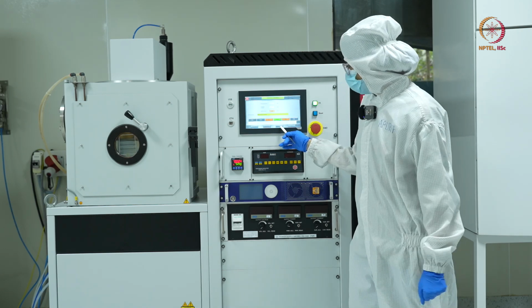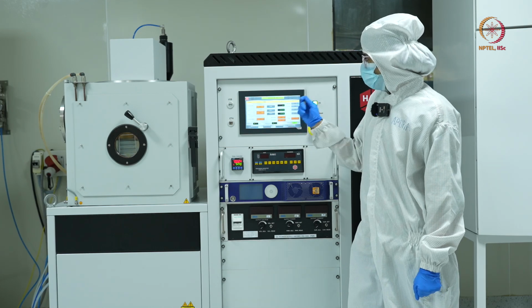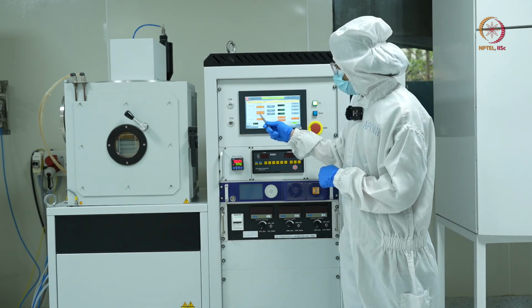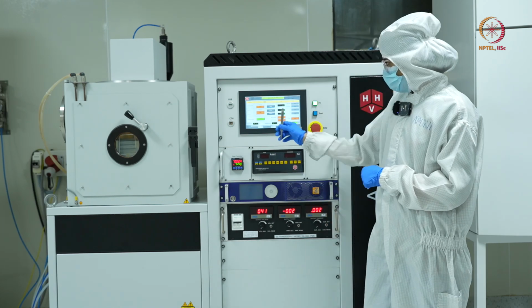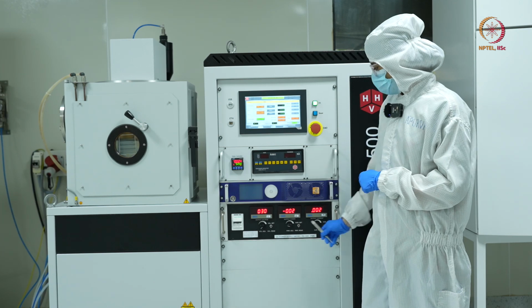Now I'll go to the source control. Today's deposition will be DC sputtering, so I'll enable my DC supply. Once the DC supply is switched on, all the displays will be highlighted here.